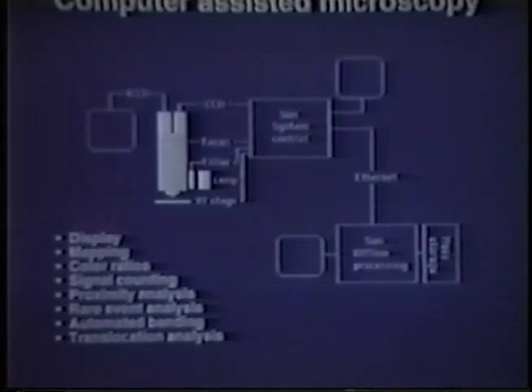Turns out that the cooled CCD is excellent for high-resolution analysis, but it takes about a second to read out one of these cameras, and so that's not particularly advantageous for roaming around on the slide looking for things to study. Now, once we have acquired an image that we want to analyze in detail, we then acquire a multicolor image using the CCD, transfer that image to the Sun system for archiving, and then subsequently to a different Sun system for offline processing.